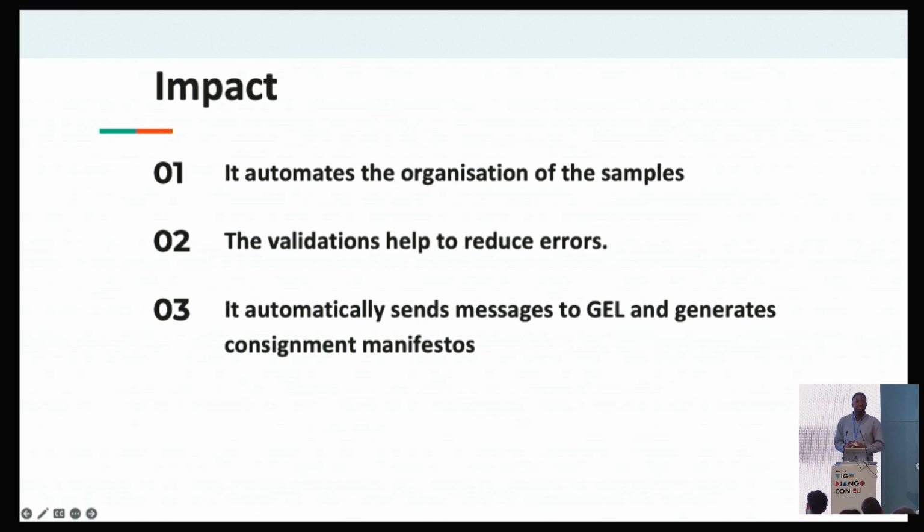The other advantage that we have by using a LIMS is all our communications are automated. So we don't have to worry, oh, I forgot to send this email, or I forgot to send this data to this particular laboratory. Once the sample has been scanned, we create a CSV file that is stored in a particular folder. Then the cron job that was built in Python will scan that folder every 15 minutes past the hour, at 9:15, 10:15. So that's one of the ways we're able to achieve automated communications with other laboratories.